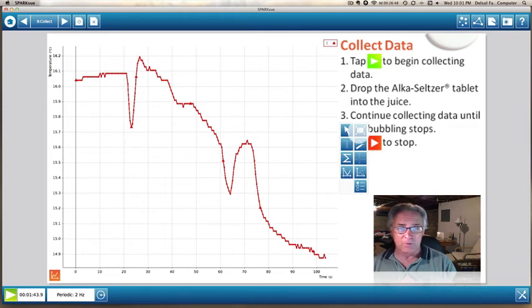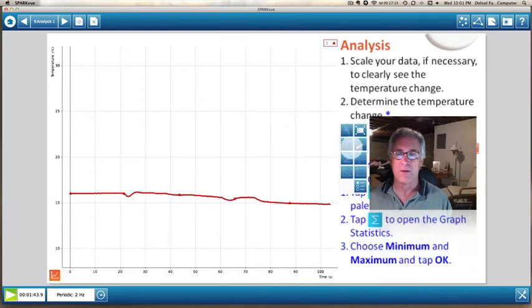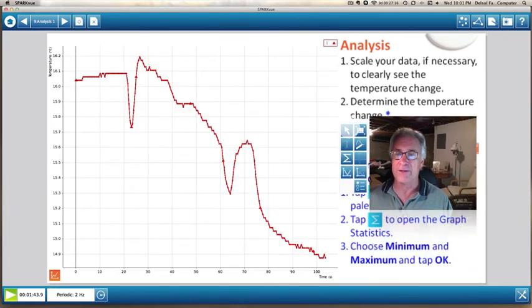Now, this particular one, yours probably isn't going to be quite as dramatic as this one. This one is definitely dramatic because of the kind of juice that I used. And I'll tell you about that a little bit later on. But some other things that you can do with this tool palette is it's going to ask you to make some calculations. So I'm going to go to the next page. I'm going to do the same thing. And there it is again.